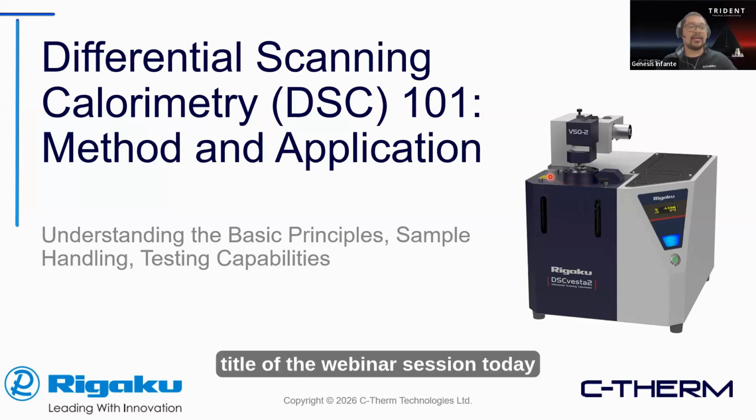As the title of the webinar implied, I will be discussing the DSC technique, or differential scanning calorimetry, mostly covering methods and applications.